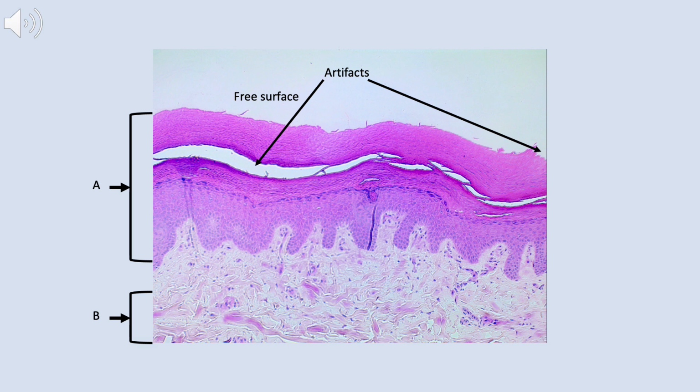Well, we do see the true apical surface at the top of the image. Now, given how thick and cellular that epithelial layer is, that is definitely going to be a stratified squamous epithelium, even without looking at the cells themselves. Likely, that thick layer will also be a keratinized stratified squamous epithelium. And this is something we haven't talked about yet, but the reason it doesn't look hairy or have a lot of air spaces like we saw before is this comes from either the sole of your foot or the palm of your hand or fingertips, where you've got thick keratinized stratified squamous epithelium.